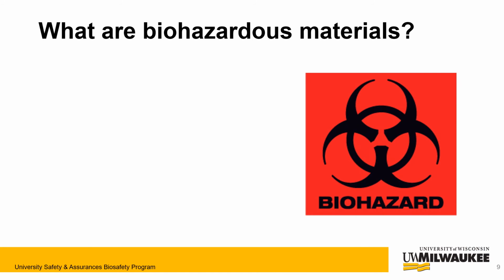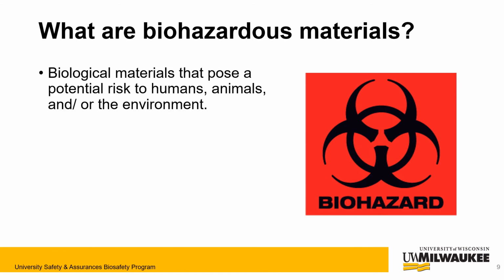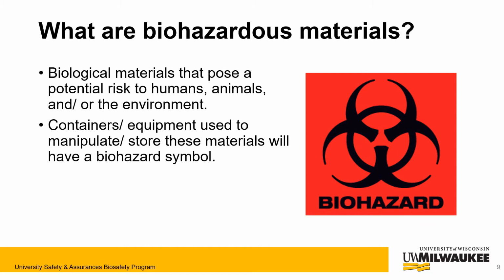What are biohazardous materials? Biohazardous materials are biological materials that pose a potential risk to humans, animals, and/or the environment. The containers and equipment used to manipulate or store these materials must possess a biohazard symbol, as seen here in the photo. Let's take a look at biohazardous materials.